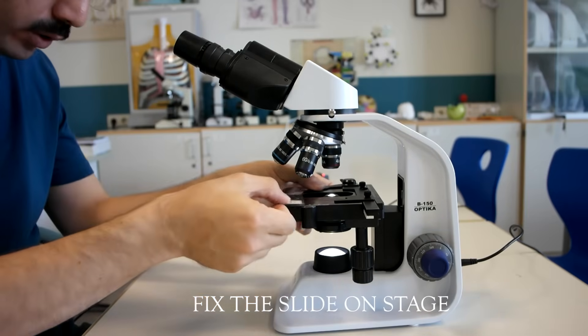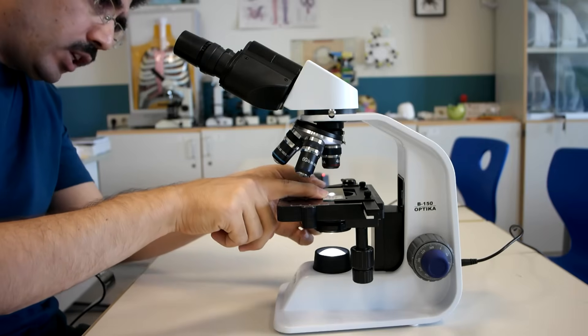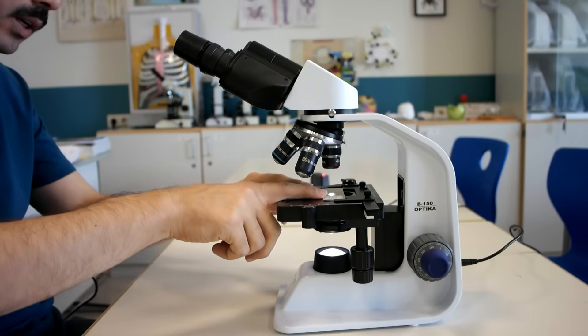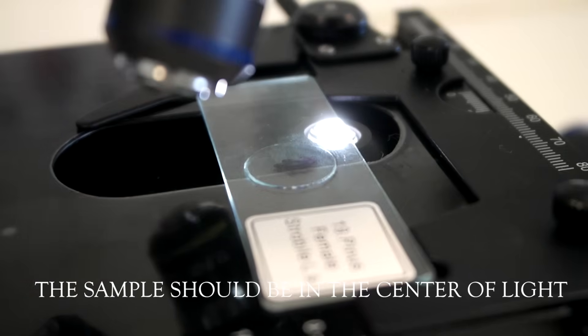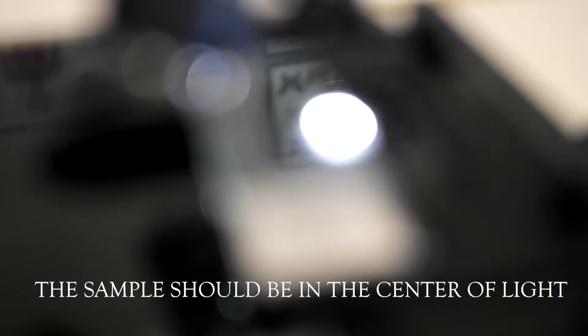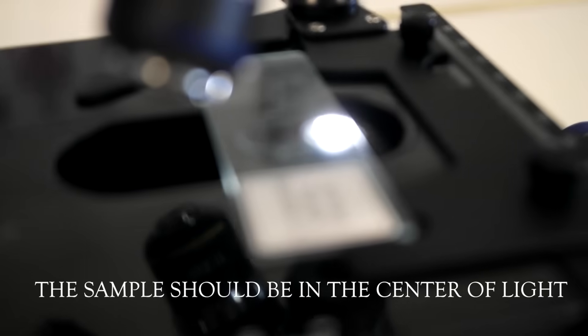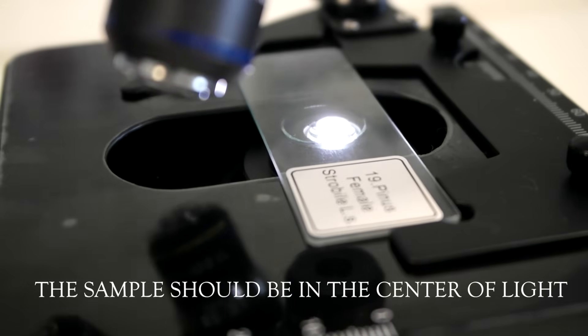And then we fix the slide onto the stage with the stage clips. First, make sure the sample is right in the center of light before you start looking through the eyepiece lens. Make sure it's right on top of light.